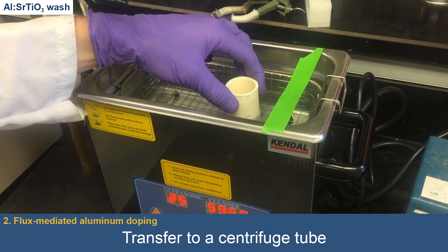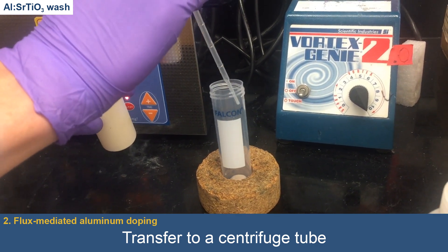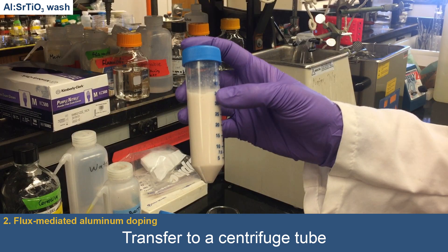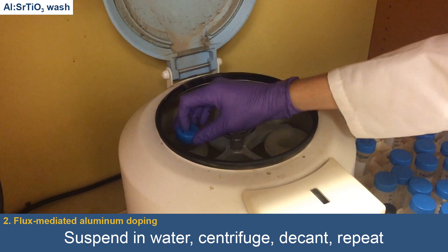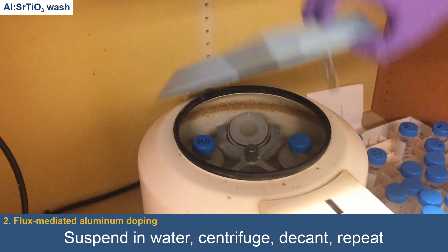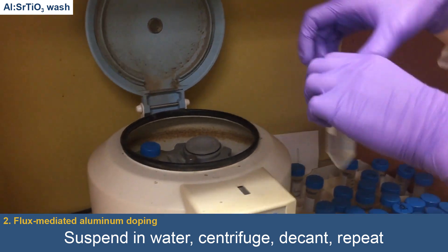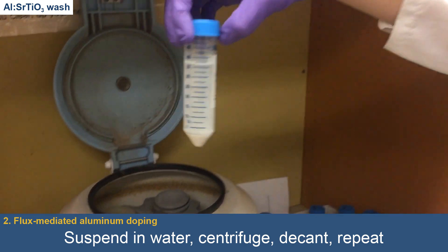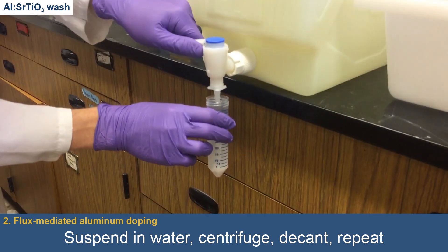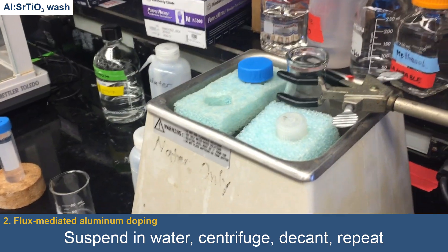The powder is transferred into a centrifuge tube by suspending it in water with a sonicator and then transferring via pipette. The tube is then centrifuged at 3,500 rpm for 7 minutes before the supernatant is decanted off. Since strontium-chloride, unlike aluminum-doped strontium-titanate, is soluble in water, it is removed with the supernatant during decanting. Water is then added to the tube and the powder resuspended via sonication before being once again centrifuged and decanted. The complete washing cycle is repeated 5 times in all.